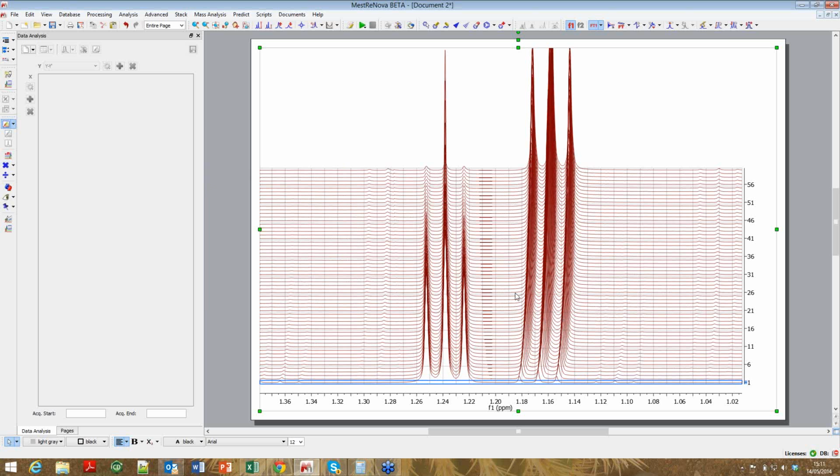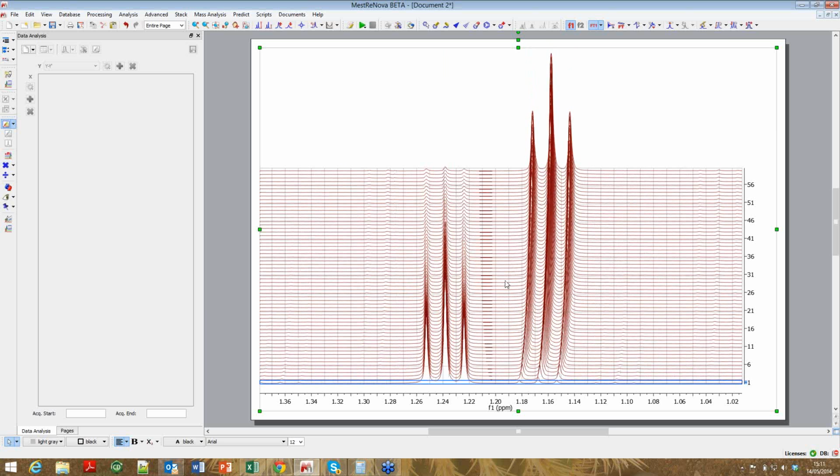Okay, I think that's all I'm going to say about alignment, but it's certainly all I'm going to say for now.